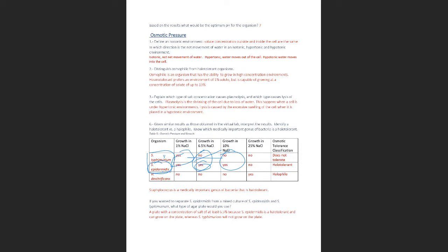Will we be doing any hemolytic plates in virtual labs in the future? Yes, we do those in unknowns, medical unknowns. We will explain about hemolytic plates, blood agar plates, and the bacteria eating up the red blood cells. That's medically very important. If this was an actual lab, we used to do it in throat cultures, because everybody has hemolytic bacteria in their throats. Some bacteria can eat up red blood cells and completely clear a blood plate, which would be bad if you had that bacteria in your blood. The bacteria that causes strep throat is one of those that can do that.